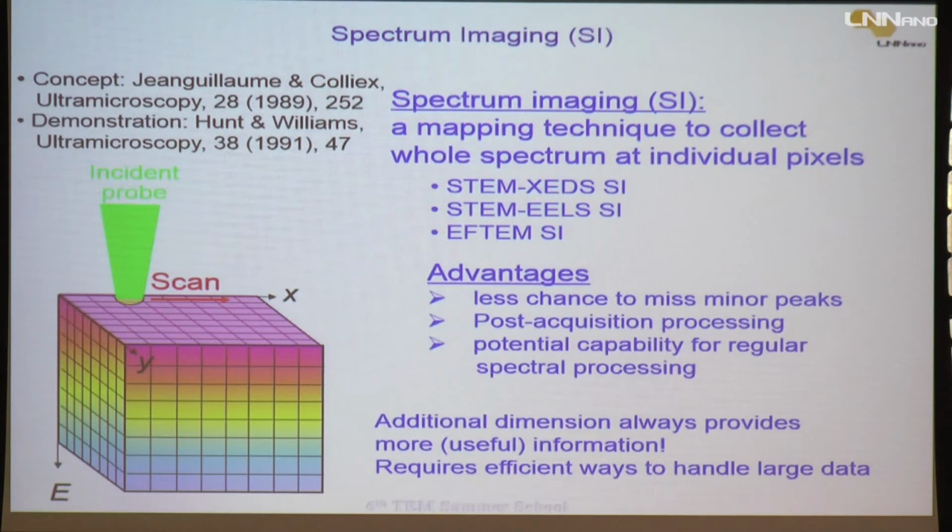Here, about the spectrum imaging, as Professor House showed, by doing spectrum imaging, what you do, you focus your beam in the STEM mode, okay, scanning mode. You will acquire one single spectrum in each pixel of your image.